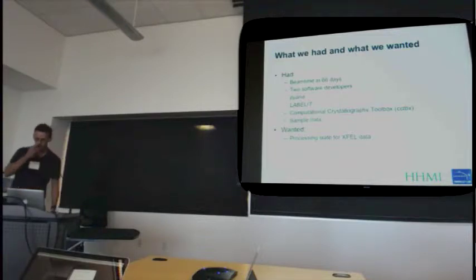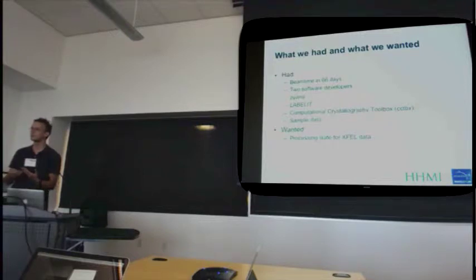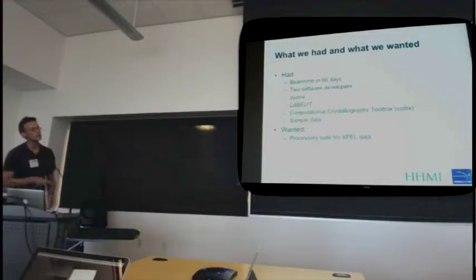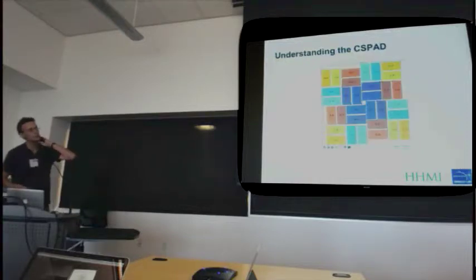Right, so the first thing then is we looked at the sample data, and as has been mentioned before, trying to extract the image, or the images that we were going to process, which is not, at first at least, a trivial task, because you basically have a blob of bits, and how do you arrange those to represent the image. Now, this is functionality, much of which was provided in psana, and we went to talk to the developers at SLAC, and after some time we were able to come up with something like this.